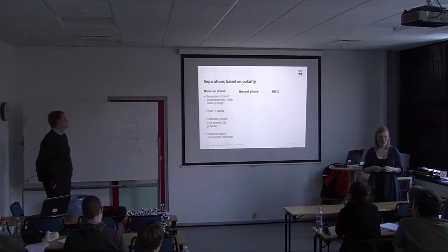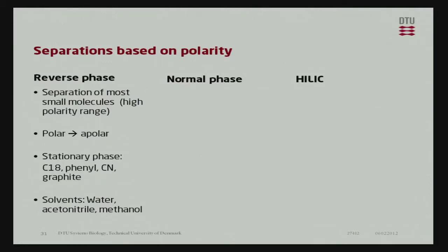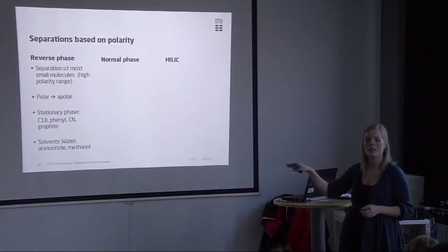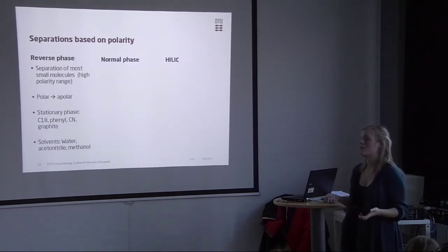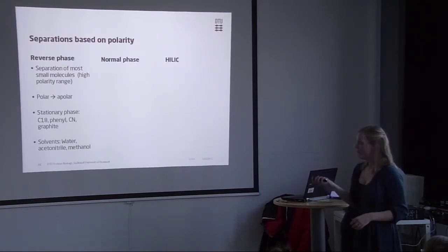The solvents that we use, the mobile phase, to pull compounds away from the stationary phase, are water, acetonitrile, and methanol. These are the solvents on the left side of the scale, the polar solvents, most of course water, and then acetonitrile and methanol. And these solvents are really good, especially when we do detection with mass spectrometry, because these solvents do not affect the ionization of these compounds. But we'll come back to that later.